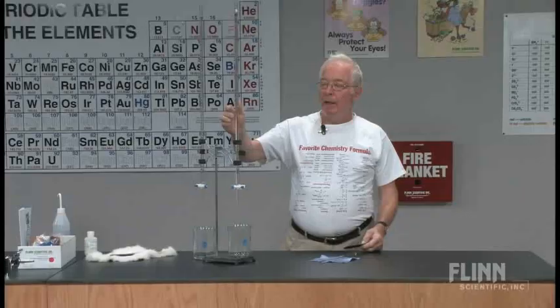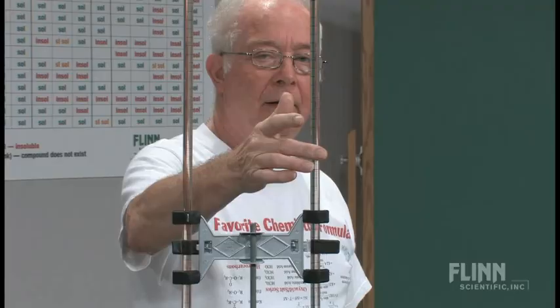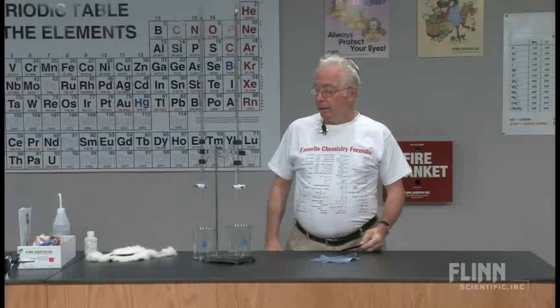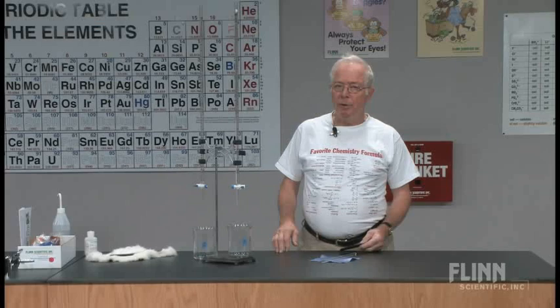In this burette, I have water. In this burette, I have toluene. And we're going to make use of one of the properties of each of toluene and water to do this demonstration.